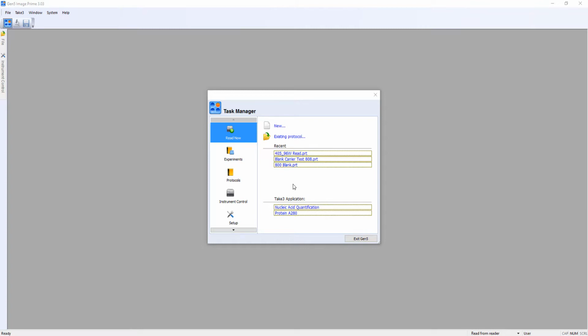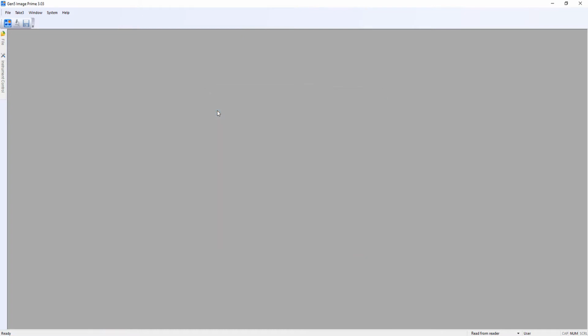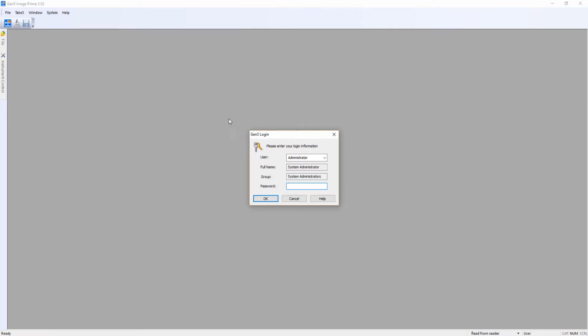To turn on Simulate mode, we'll want to click this blue microplate icon, and then from the System menu, select System, Administrator Login. The default password from install is admin in all lowercase letters.